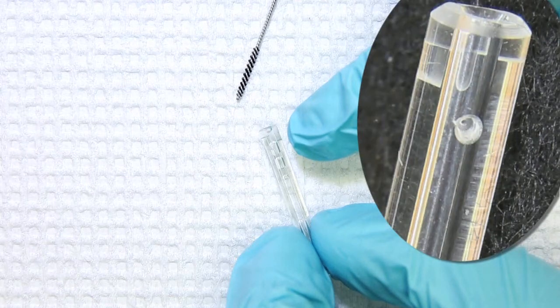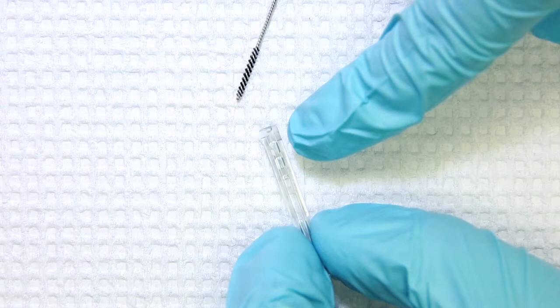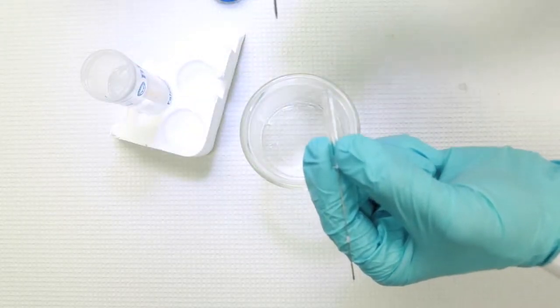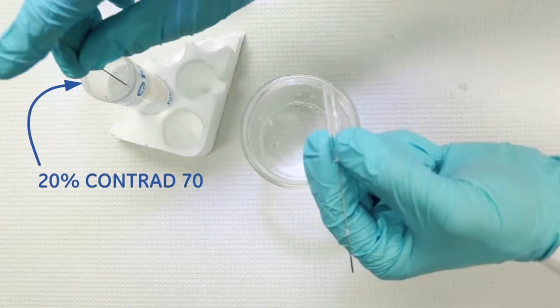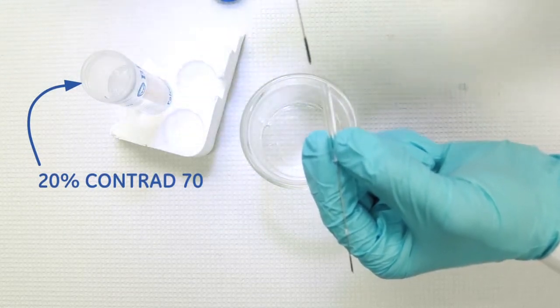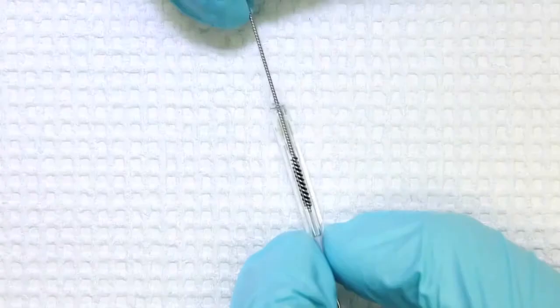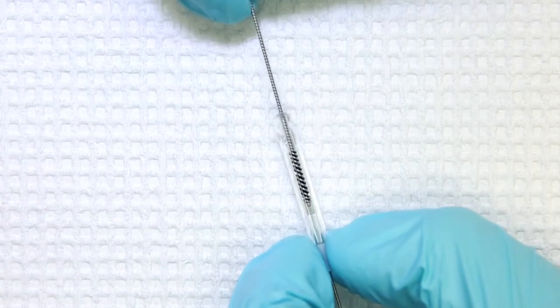It's also good practice to clean the uppermost portion of your syringe, which may not be adequately cleaned by the instrument itself. To do this, dip your syringe cleaning tool into a mixture of 20% Contrad and gently wash the inner part of your syringe glass.